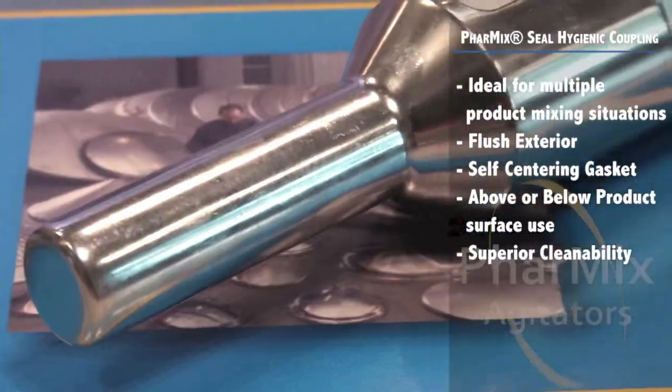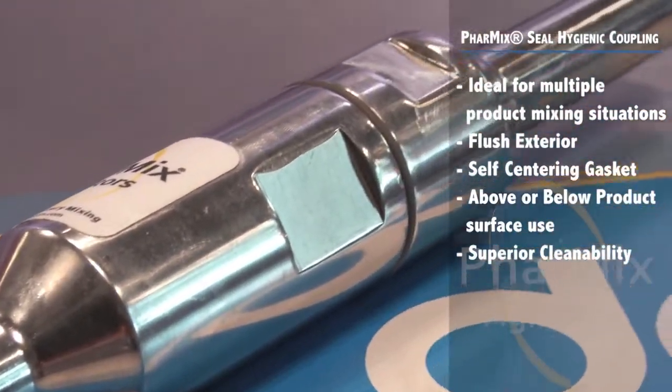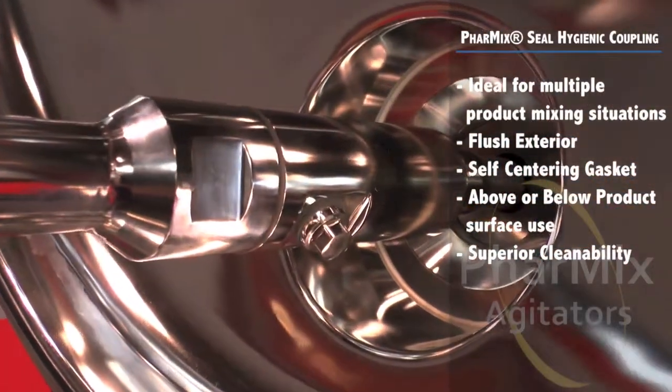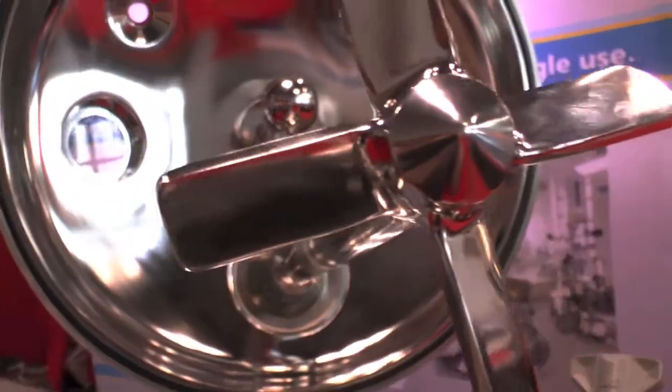The hygienic coupling also features a self-centering tough steel gasket which ensures quick and easy installation, and the gasket will not extrude like standard o-rings. The uniquely designed Farmix seal hygienic coupling can be used above or below product surface and accommodates frequent equipment inspections and superior cleanability.